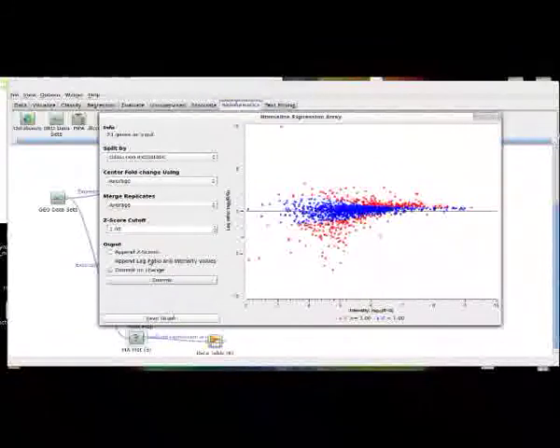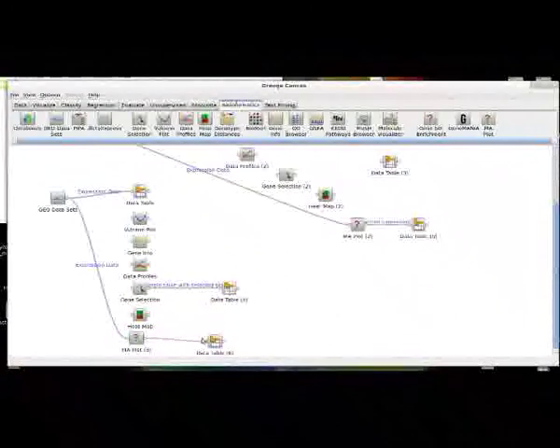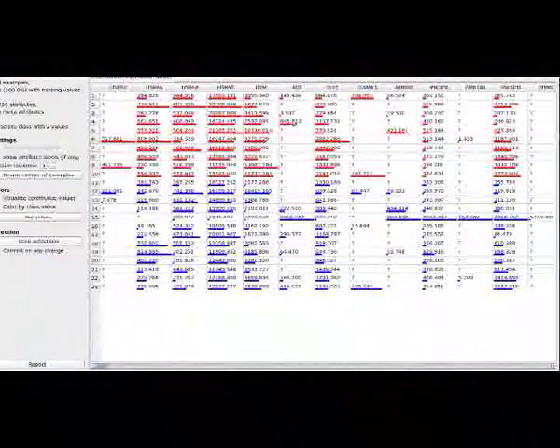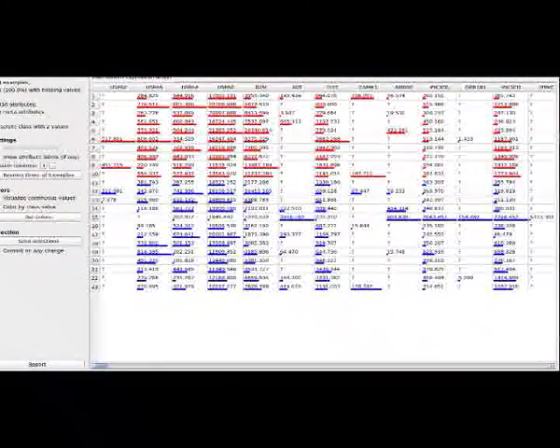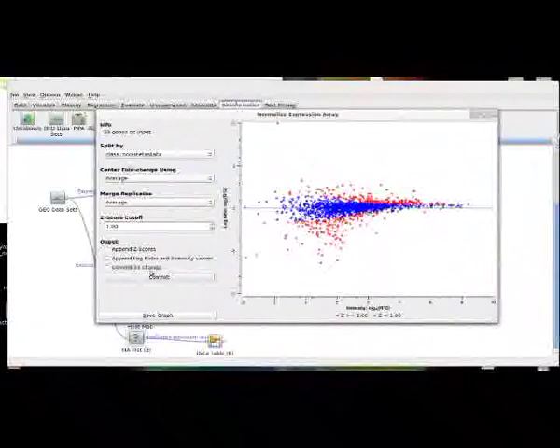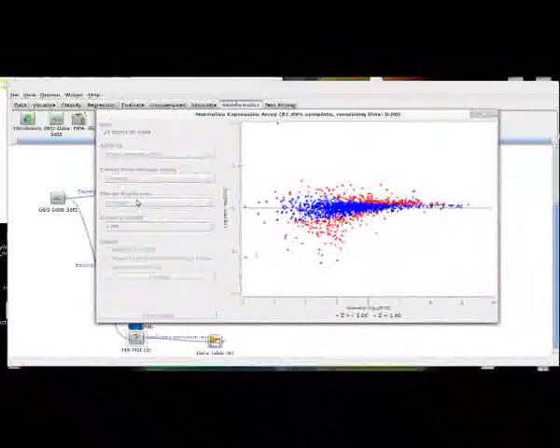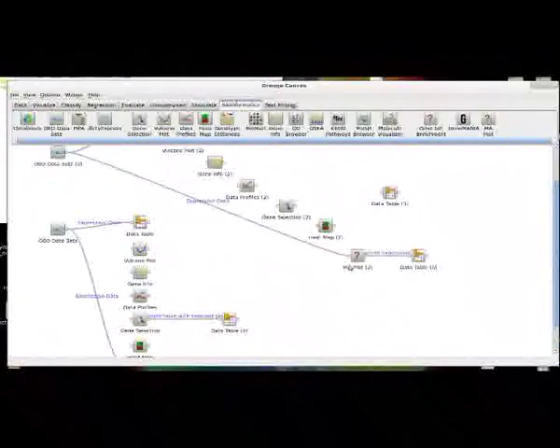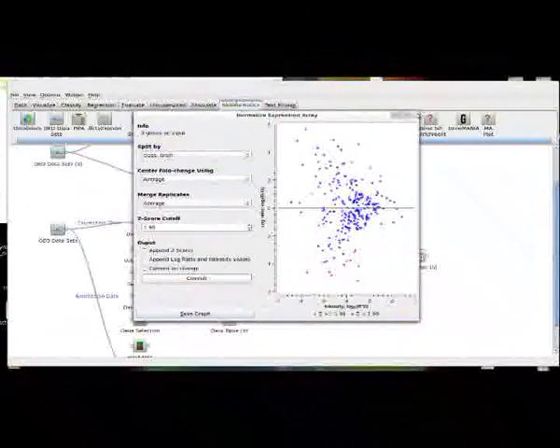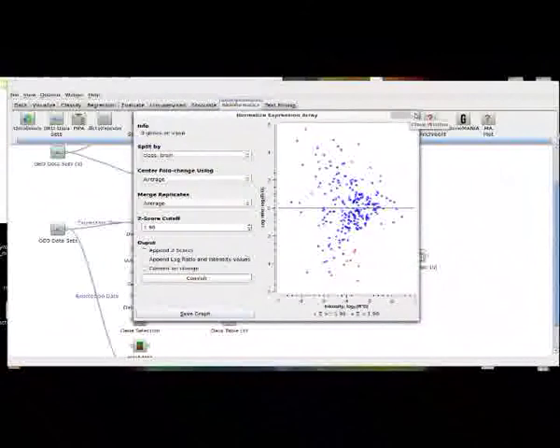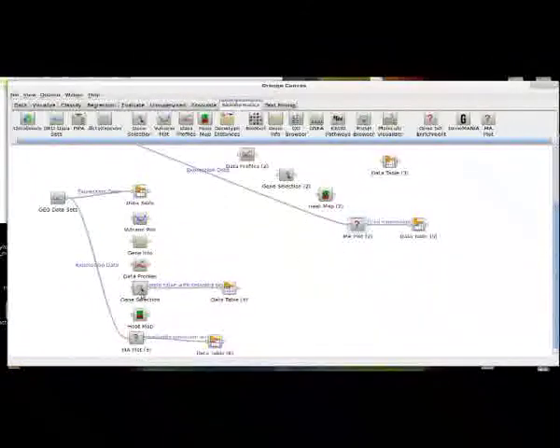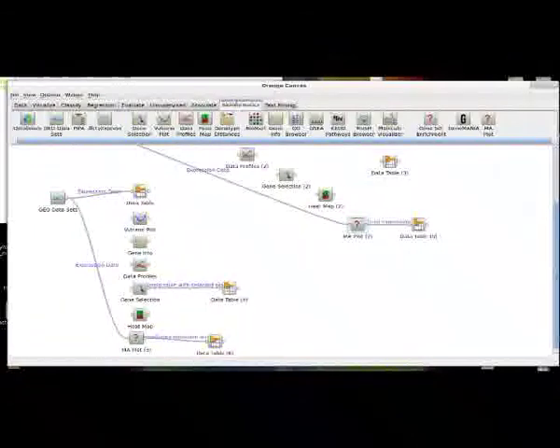So we've committed this with a 1.0 z-scores cutoff, and I have to reset this signal, and we look at our data table, and, oh, this is a terrible example. Oh, god. So it doesn't appear that things are normalized as I had intended. I guess I need to play with this more. Well, I played with MA plots before with unnormalized data, and I was able before to get it down so that, hmm, let me play with this for a second and be right back with you.